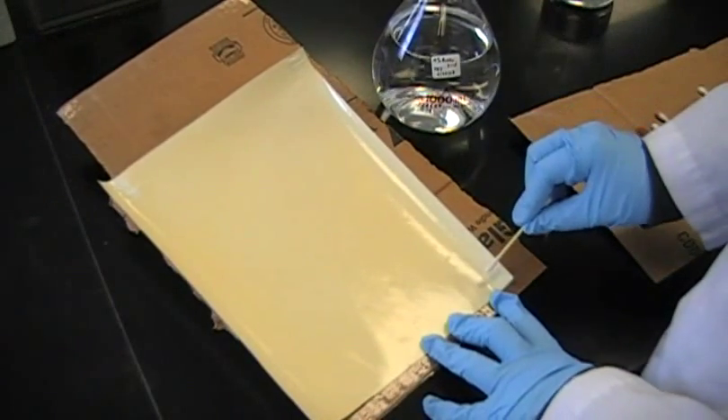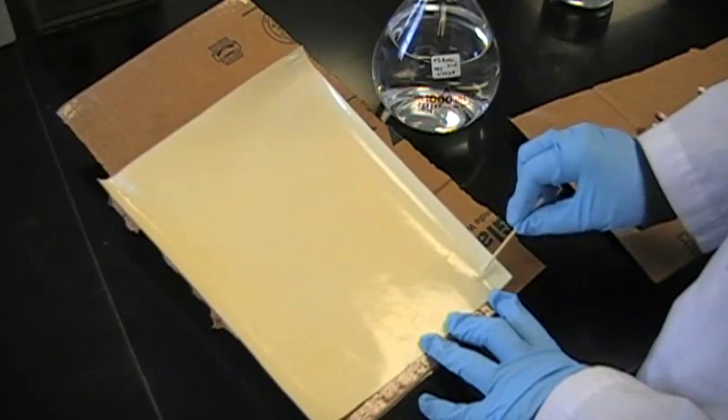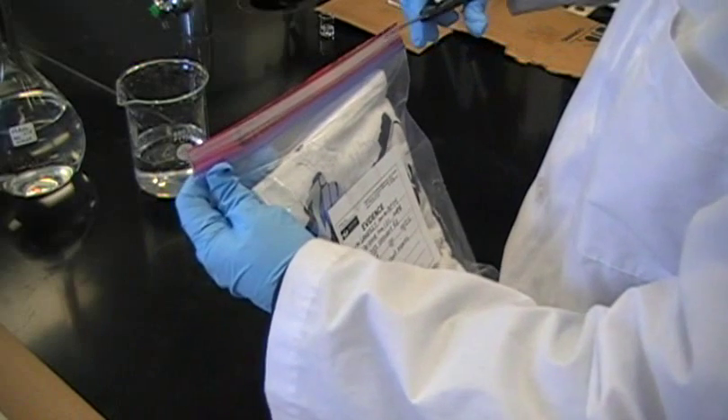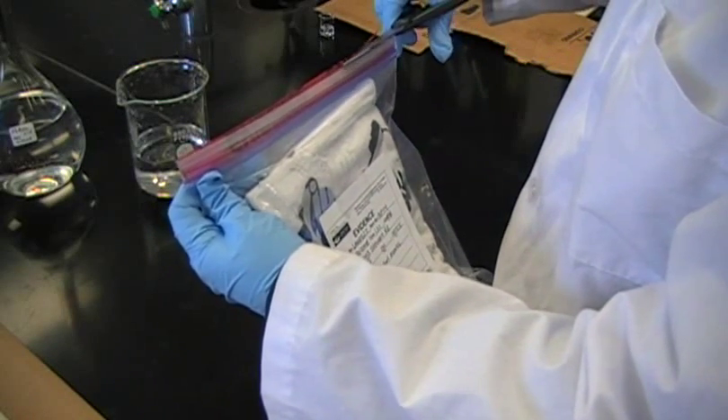To make sure the paper works, a Q-tip is soaked in sodium nitrite and dried. It is then dipped into acetic acid and touched to the paper. A pink color confirms the paper works.